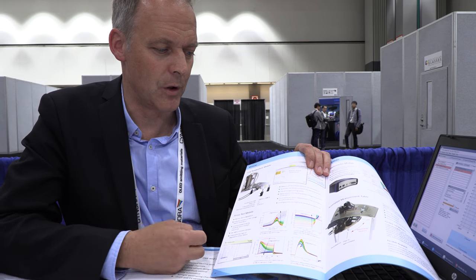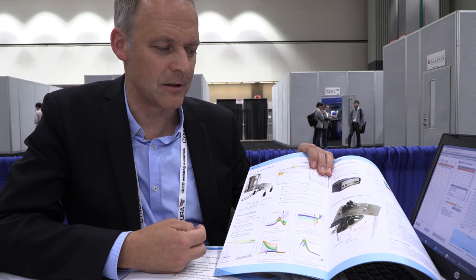And so that was with the blue or some other things in OLED that are degrading? Yes, exactly. Blue is still a challenge for OLED displays. The blue is not as stable as green and red and there is a lot of chemical synthesis effort going on to improve the material that emits blue light and our research tools help in this challenge.